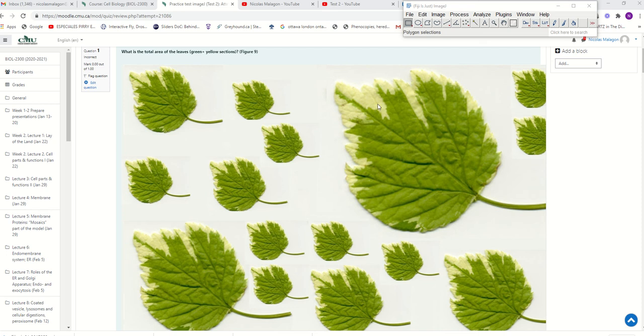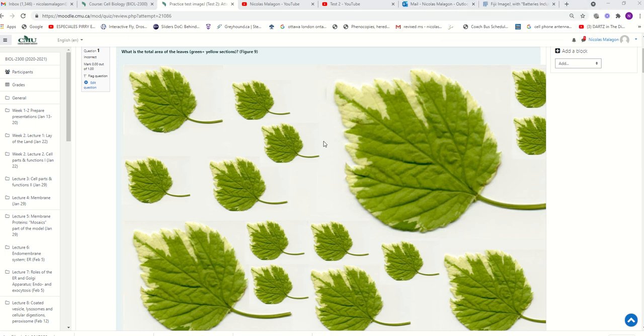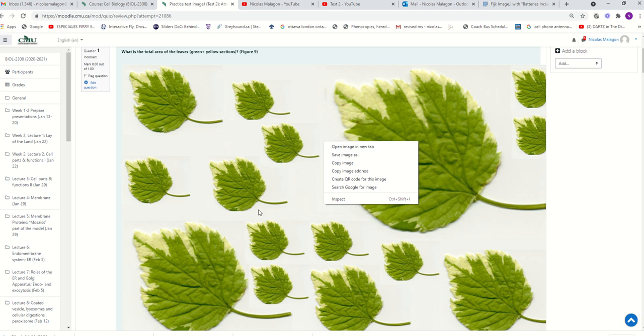Here there was one difference: if you apply binary here, as we have applied before, it will be more challenging because this will detect it as white. So how do we solve this problem? Very easy. So again, you can save it as an image or you can go to figure 9.